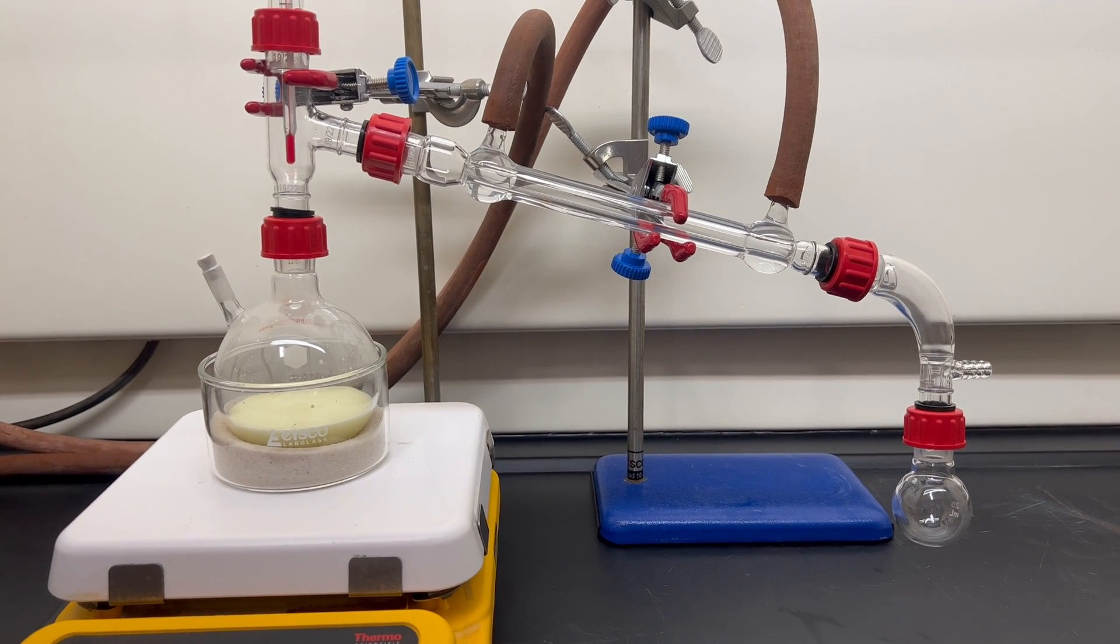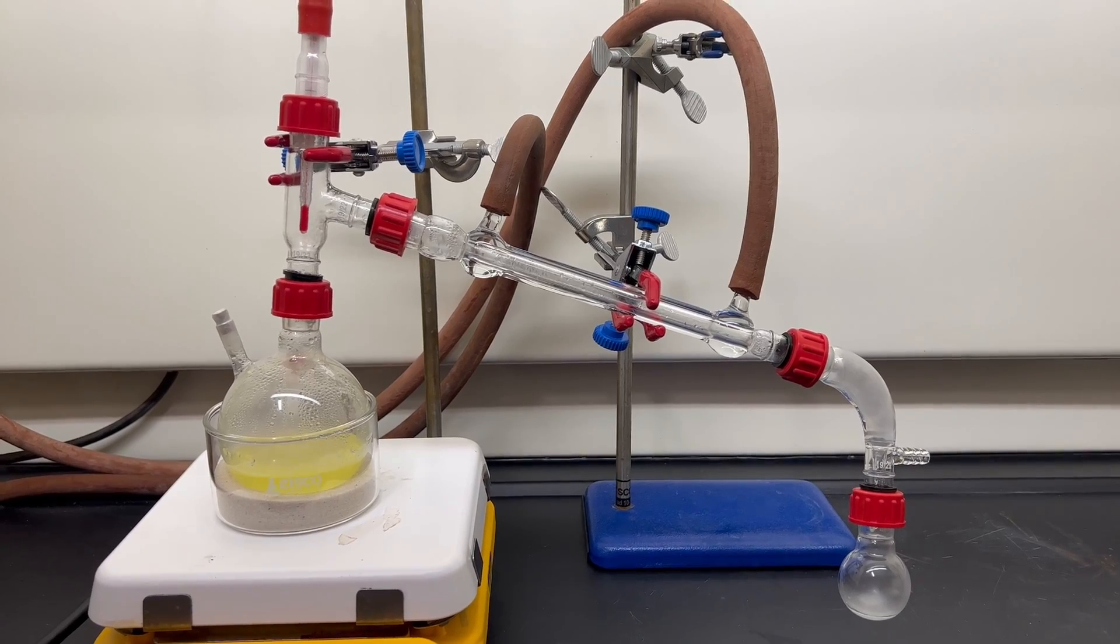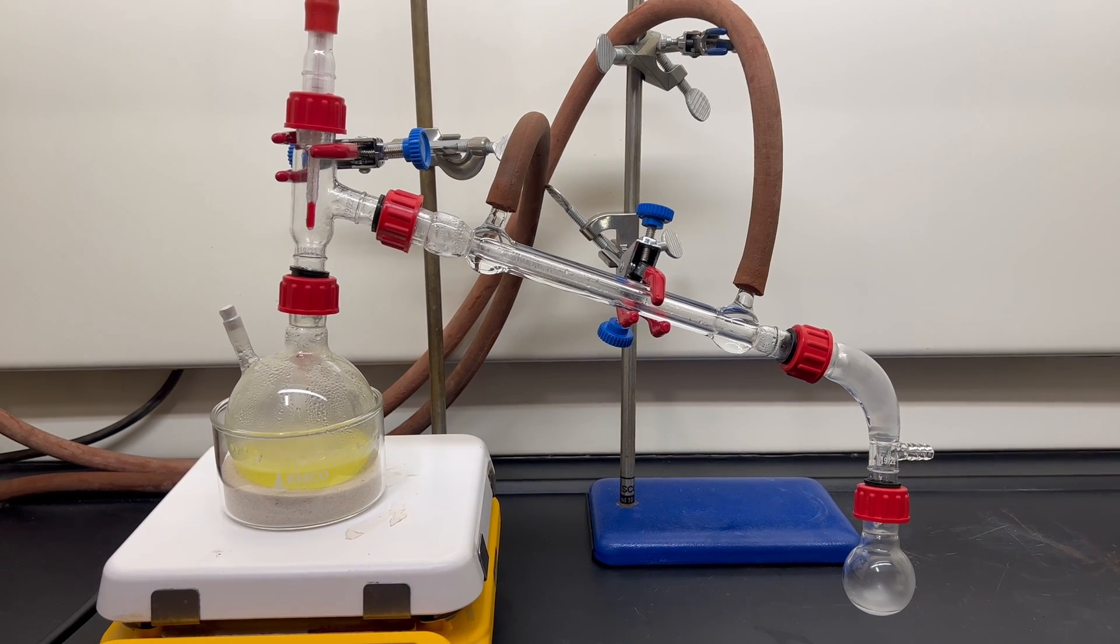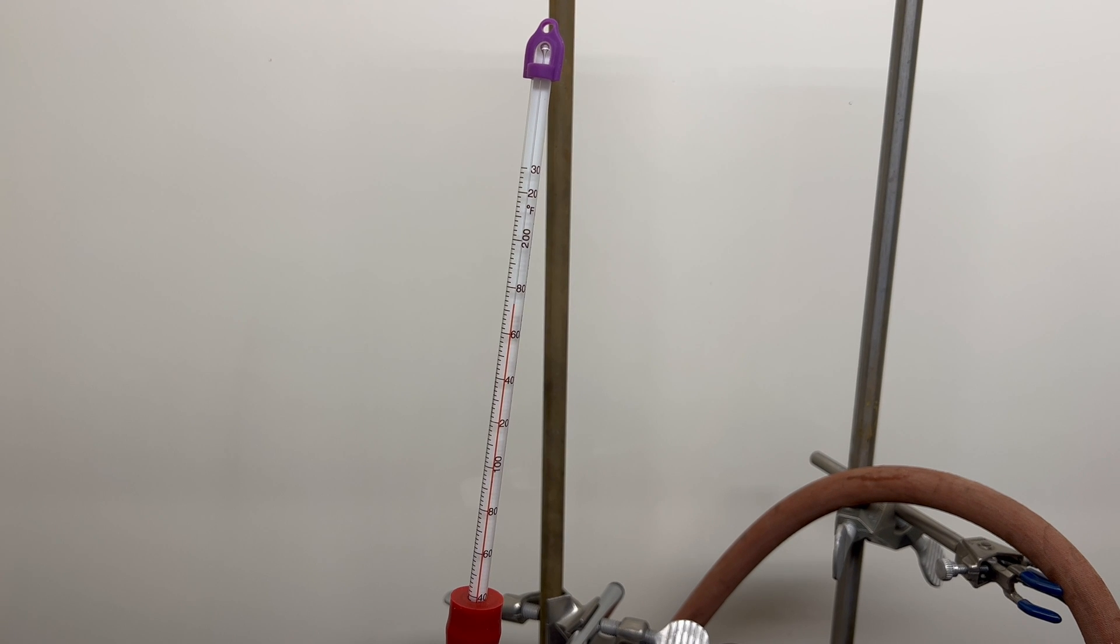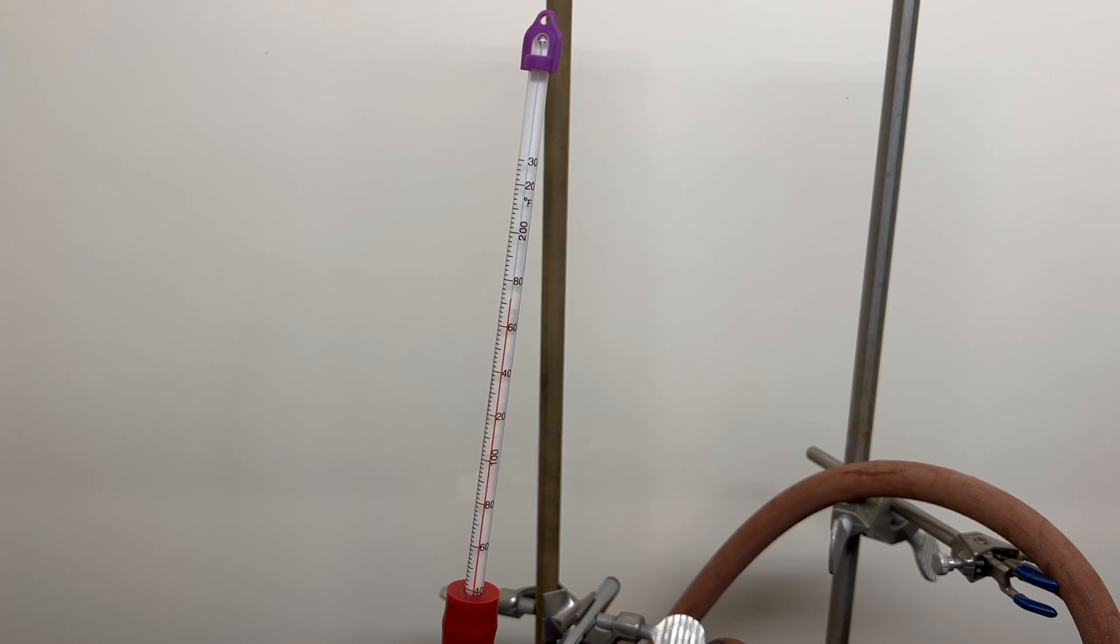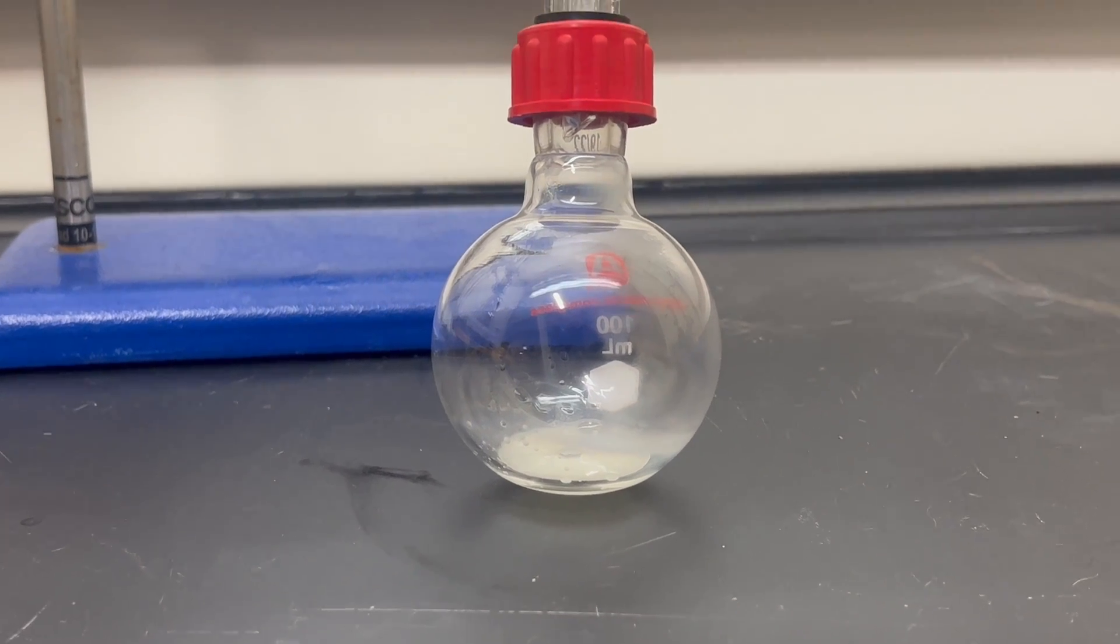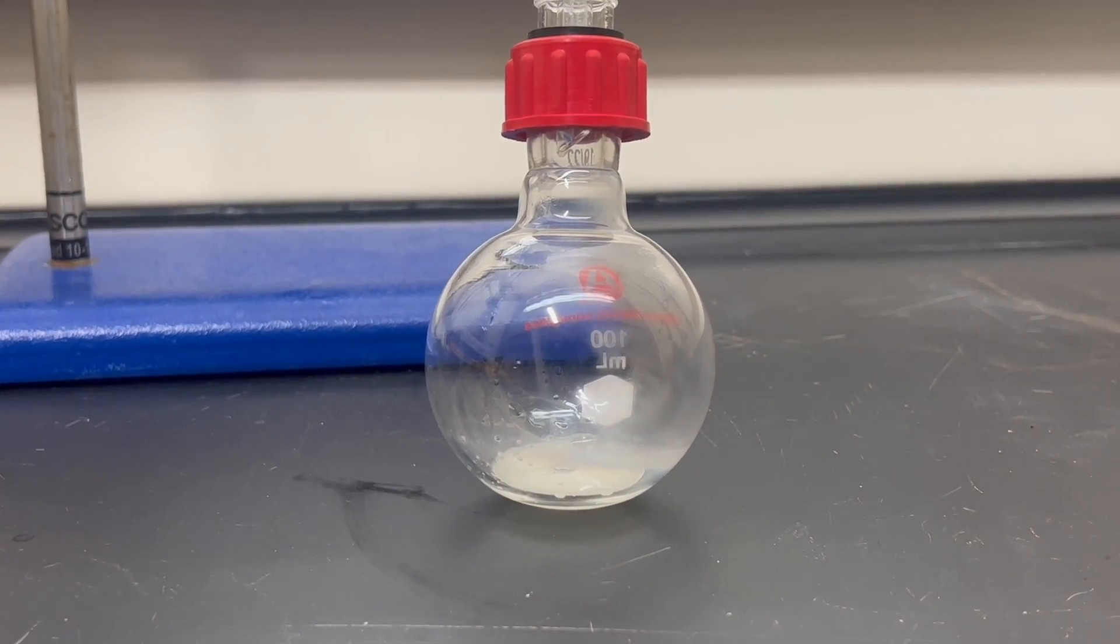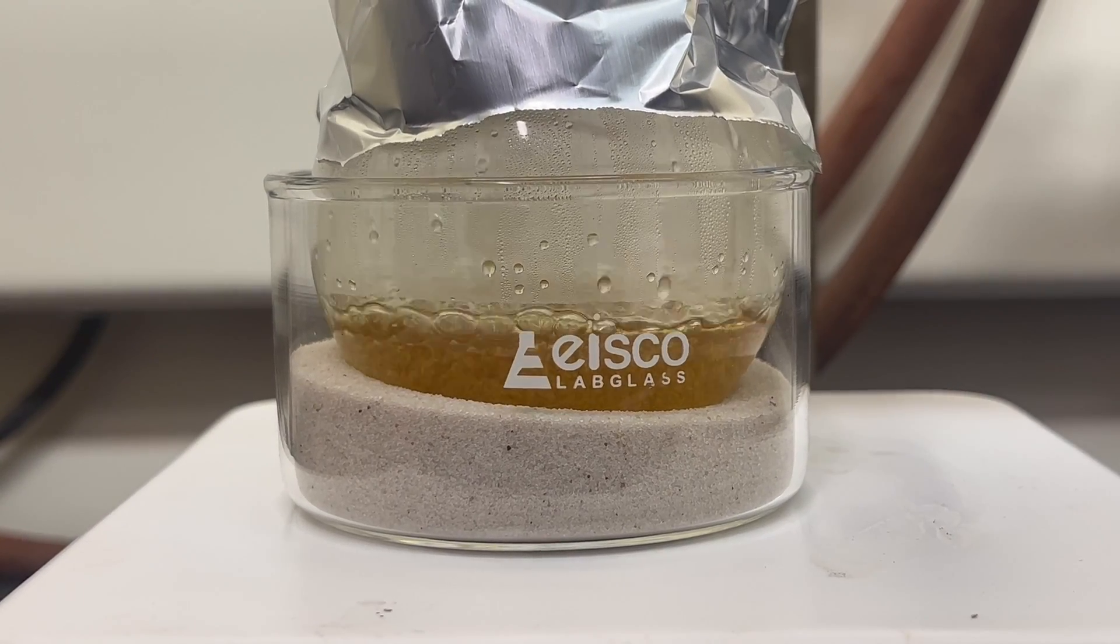Next, the cloudy nitrobenzene is distilled to remove any unreacted benzene and to remove any produced dinitrobenzene. Benzene boils at 80.1 degrees Celsius, so anything that comes over before the boiling point of 210.9 degrees Celsius, the temperature in which nitrobenzene boils, is discarded. The flask is then switched out when the proper distillation temperature is reached.